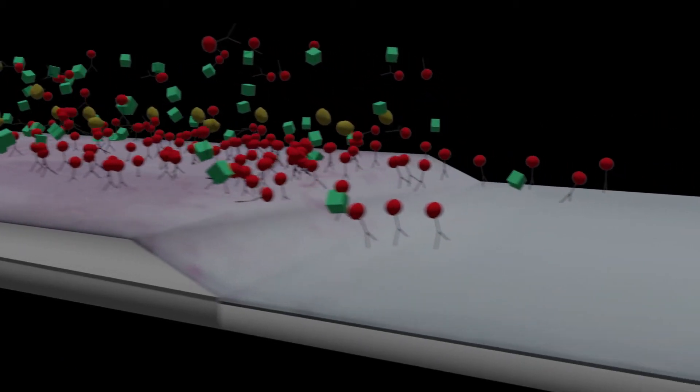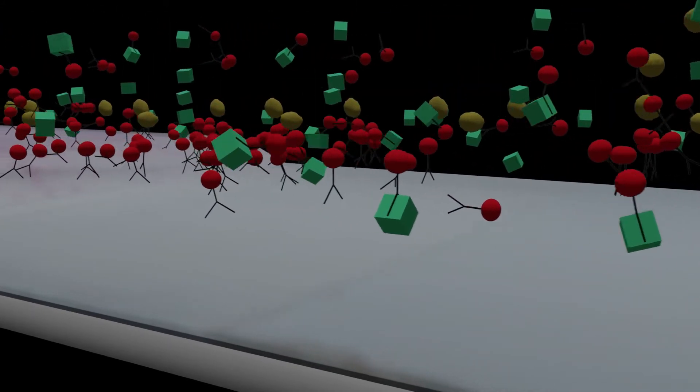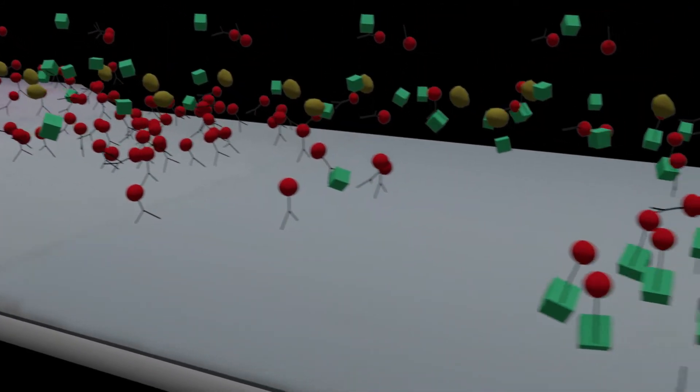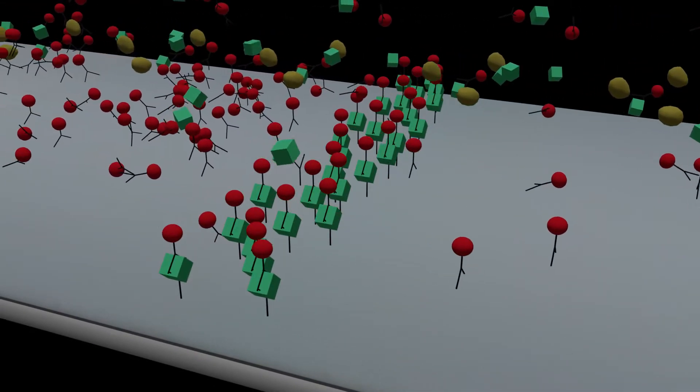Target allergens contained in the sample bind to the color-labeled antibody. Together, these bind to the antibody on the test line, forming an antibody-target allergen-antibody sandwich.